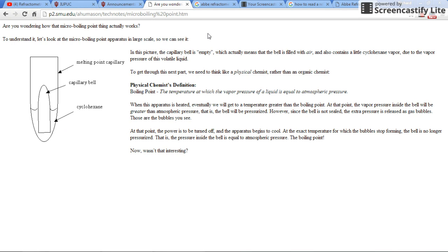So really all we're doing this time is doing 3 physical properties of a substance: the boiling point, the refractive index, and the density. Match them up in a table real simply. It's a very easy lab. And make a determination from that. Is my chemical one that has an octane rating above 87? If it does, then in theory, it could be a good gasoline additive.